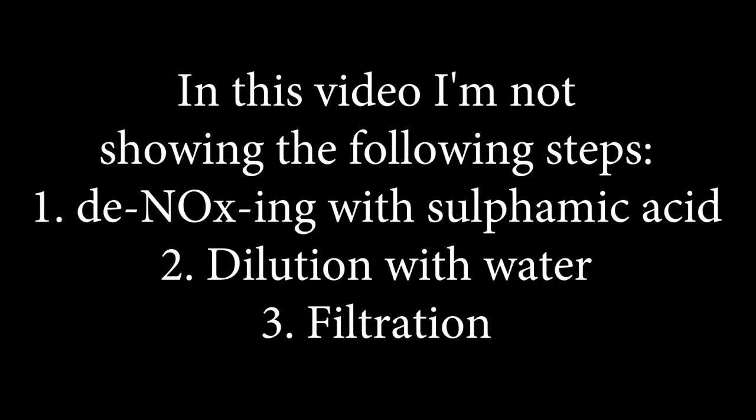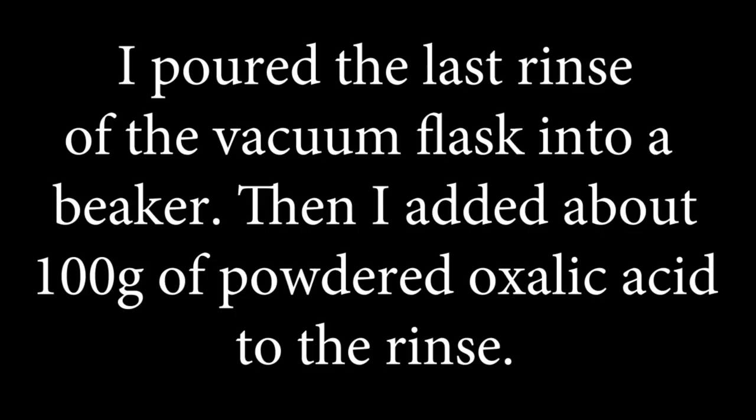In this video I'm not showing the following steps: first, de-NOx-ing with sulphamic acid; second, dilution with water; third, filtration. I poured the last rinse of the vacuum flask into a beaker, then I added about 100g of powdered oxalic acid to the rinse.